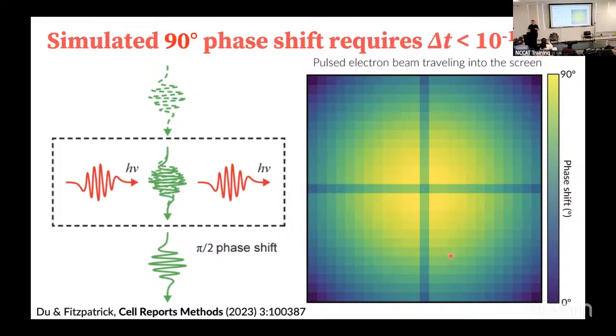The best way of getting a more circularly symmetric phase shift is to have two laser beams at right angles. If you have two of them at right angles hitting the electron beam coming down, it really is more like a square, but it will feel more like a circularly symmetric electromagnetic field on the electron beam.